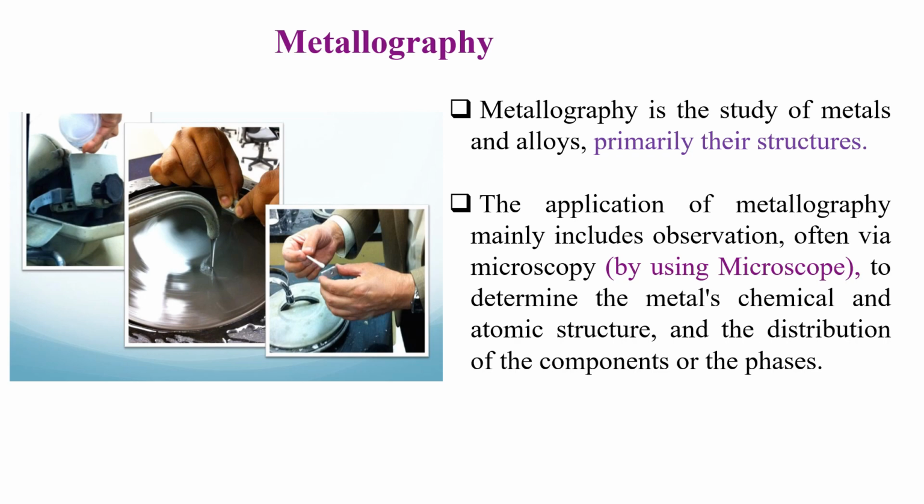See guys, what do you mean by metallography? Metallography is the study of metals and alloys, primarily their structures. So in metallography, we are going to study the structure of the materials or alloys.